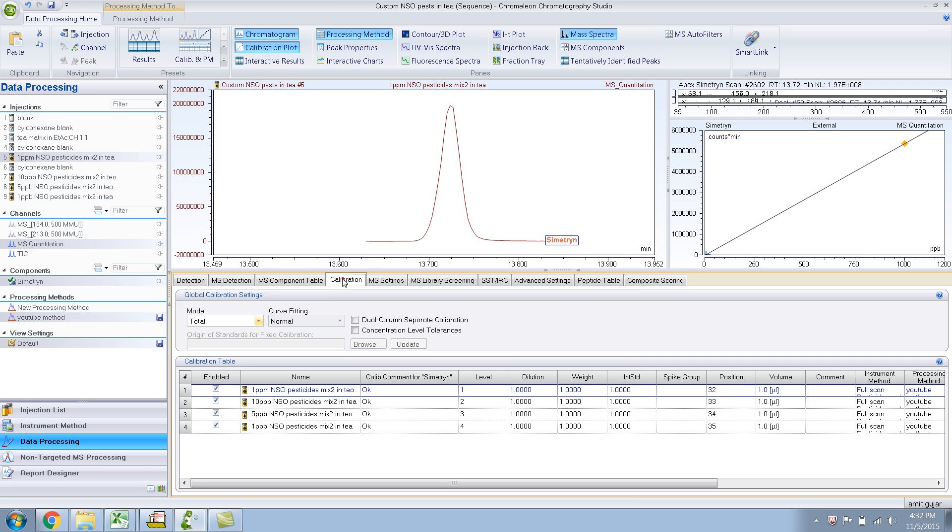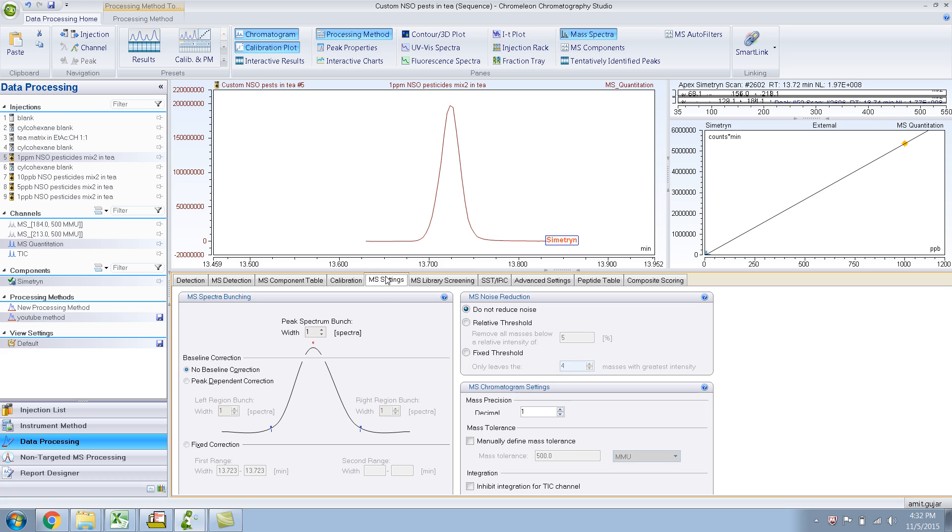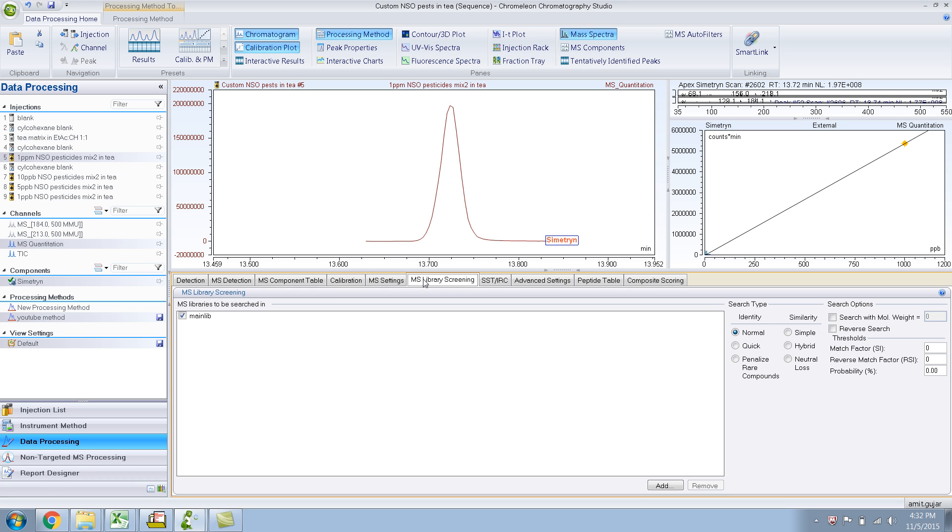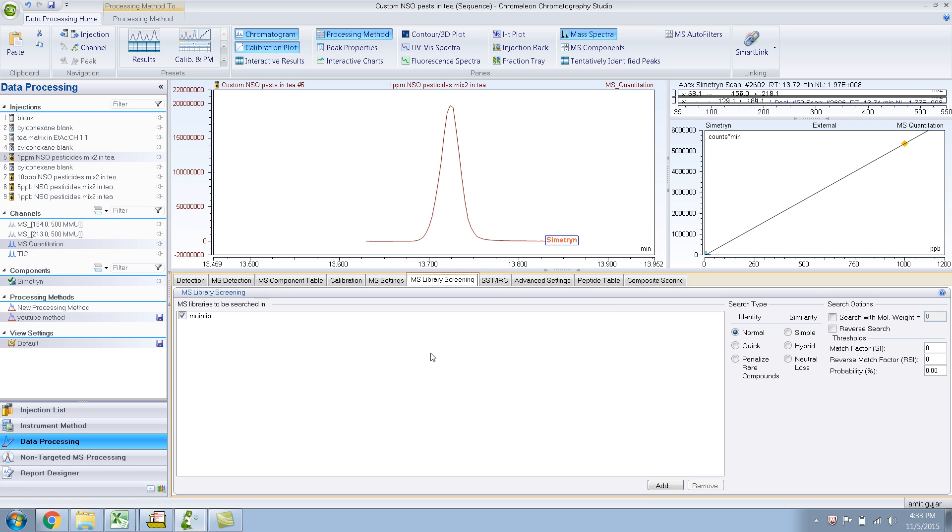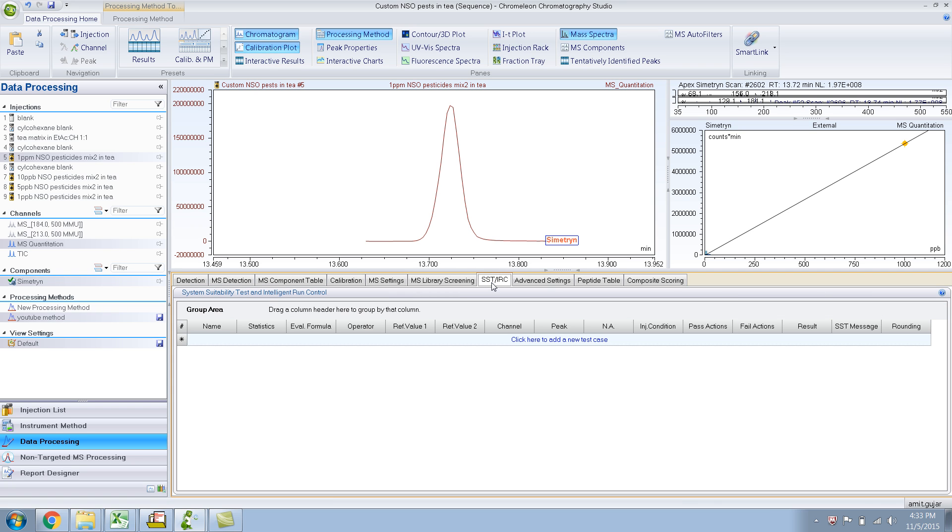I am done with calibration, I am done with MS settings. MS libraries screening I have already shown you. Like I showed you in one of the previous videos, you just click add and go to your folder, which is the MS search folder and you should have your libraries in there and just add your libraries.